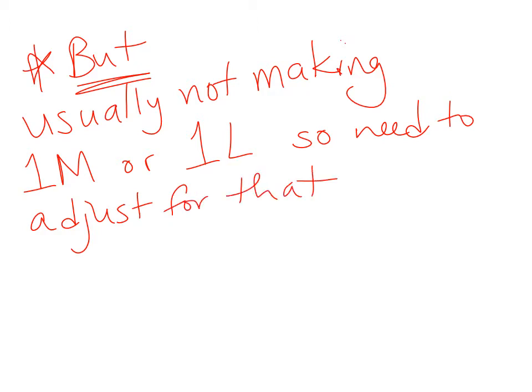And you're going to see in the example that we're going to do next exactly how we adjust for that, the idea that you're making a different molarity and a different volume.